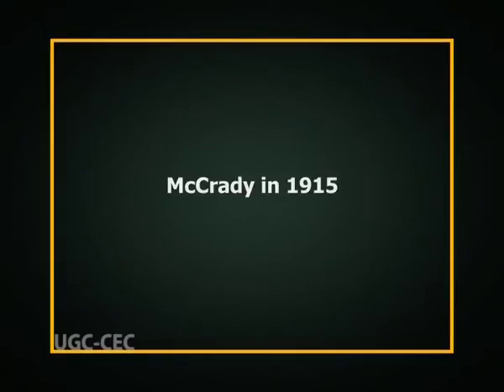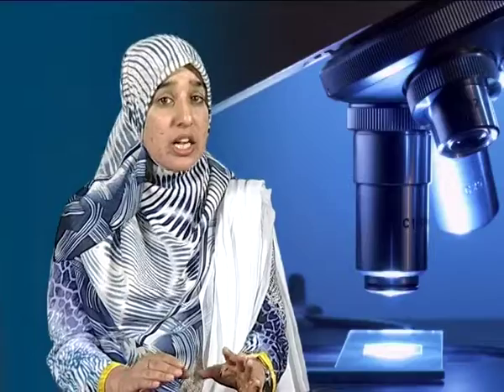The method is statistical in nature and MPN results are generally higher than SPC results. This method was introduced by McCrady in 1915. It's not a precise method of analysis. The 95% confidence intervals for a 3-tube test range from 21 to 395.